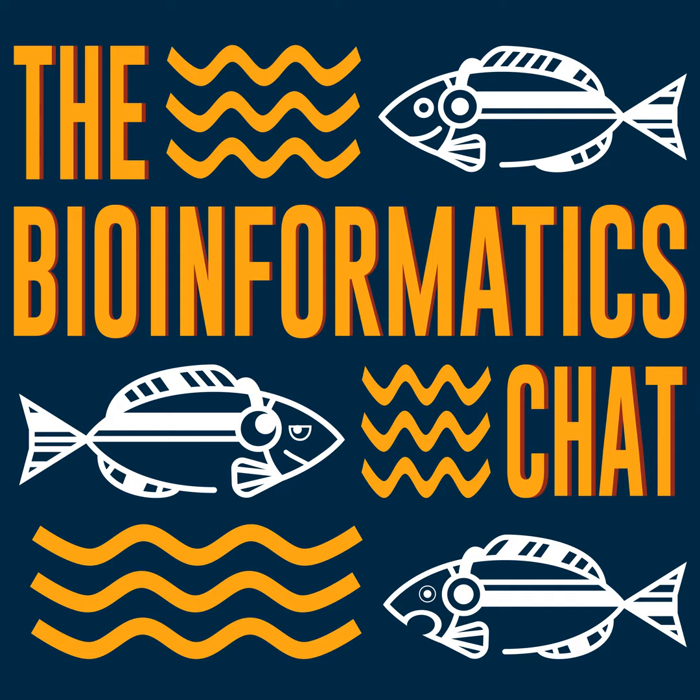Right, so this is part of the wet lab protocols that we followed in order to create these sequences. We didn't necessarily want to have the entire molbit sequence start to finish, and instead we just wanted to have the unique portion synthesized for us. And then we combine that with the spacer sequence and the barcode on the flip side. So we use a process called Golden Gate assembly, in which there is a 4-base overhang that is left at the end of this 40-base unique sequence. And then the spacer sequence will have the reverse complement of that overhang.